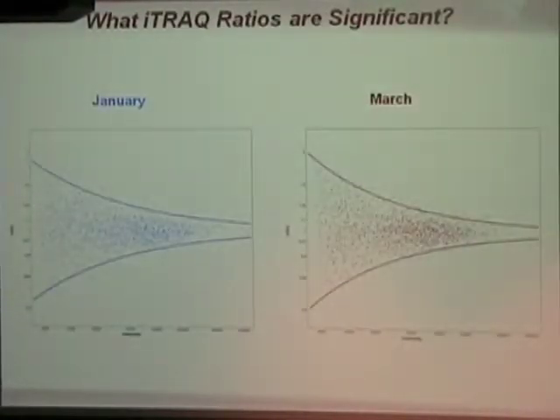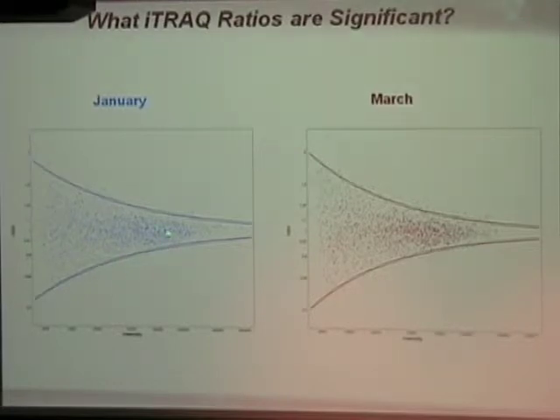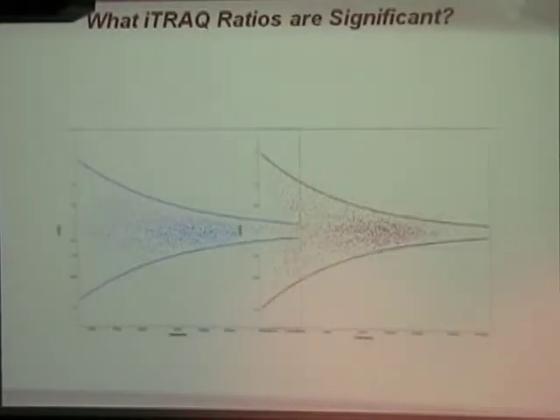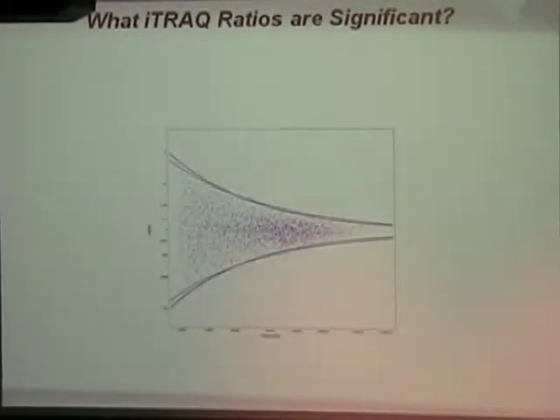At the very least, what we've been able to show is that this is a stable relationship between intensity and variance, because we did this months apart, and the variance function that we learned is basically the same. So what we can say is that an instrument, and this is an Orbitrap looking at iTRAQ data, can be calibrated what the mass spectrometrists call externally. It's sort of like an external quant calibration. You do it once, and then you know this relationship, and you can use it throughout your experiments.